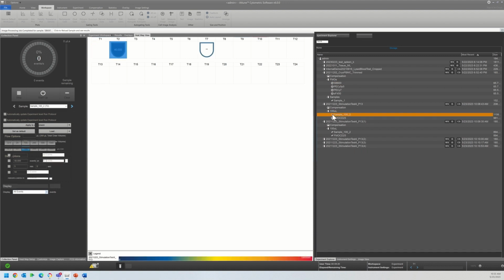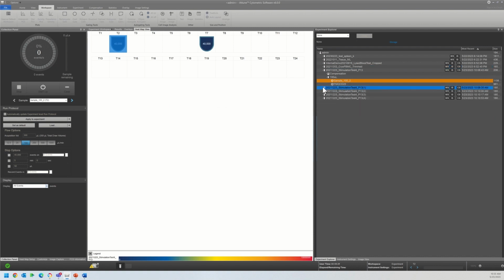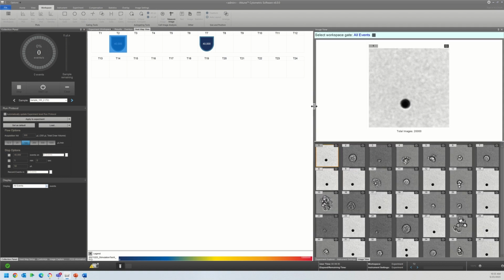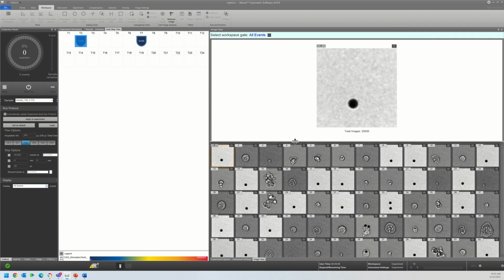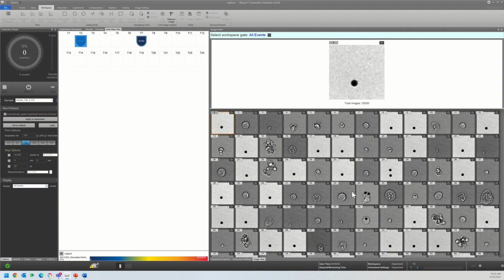once processing is completed, which we can tell because of the circle around the check mark, we're going to need to do some basic quality control steps of the annotation. So here I'm going to pull up all the images in the sample. And as you can see, this is a bead stimulated sample. This is what I would consider a complex sample type for this model because there are varying morphologies, varying sizes and shapes, varying textures, and lots of dead and dying cells.